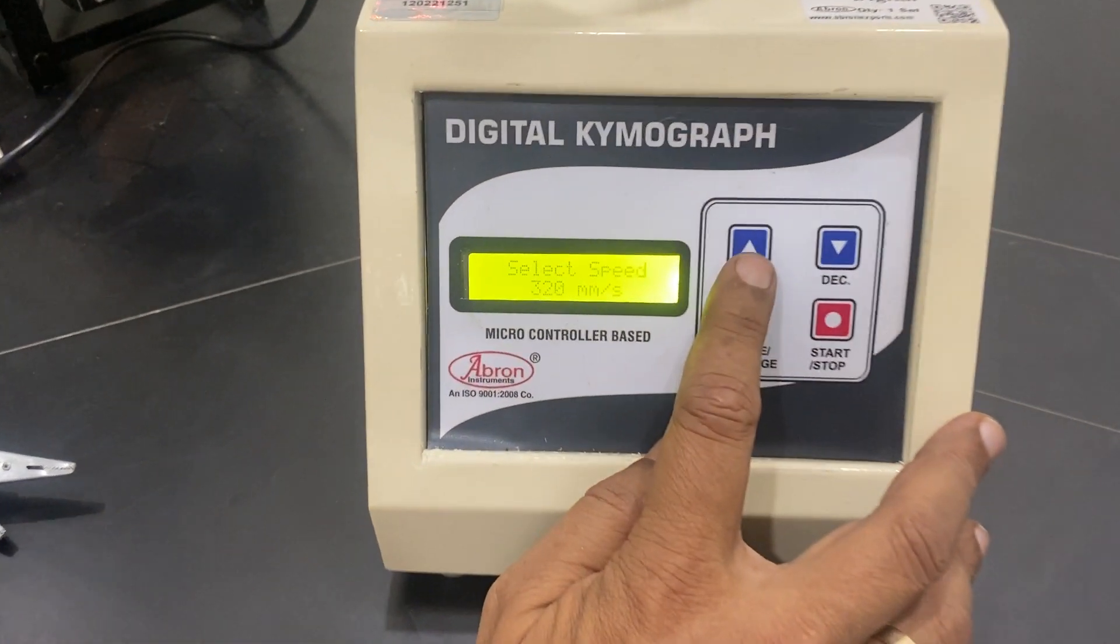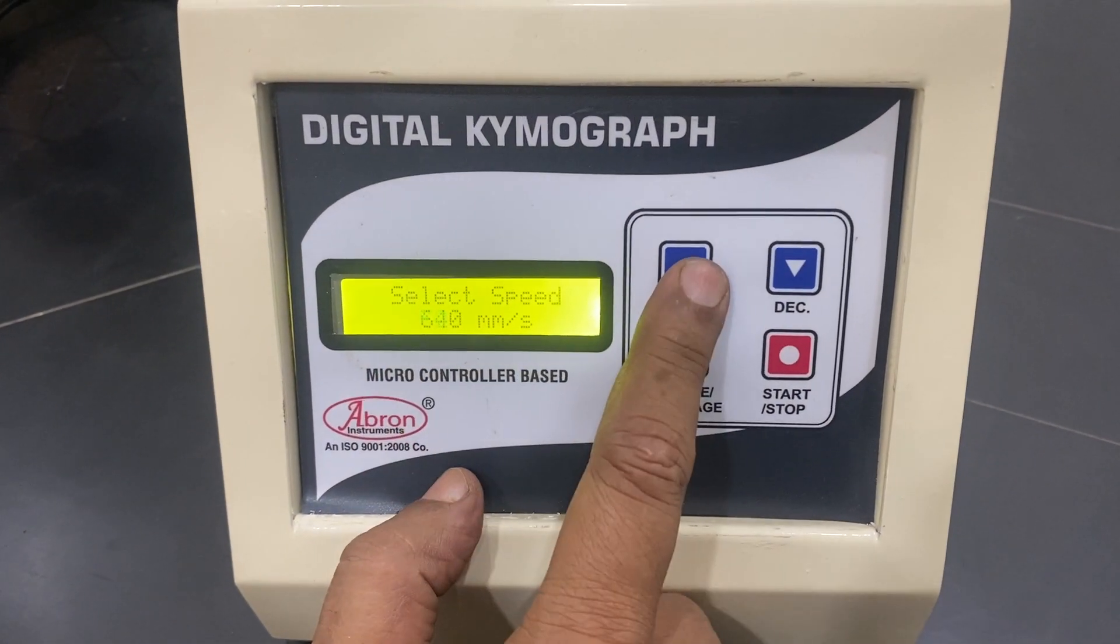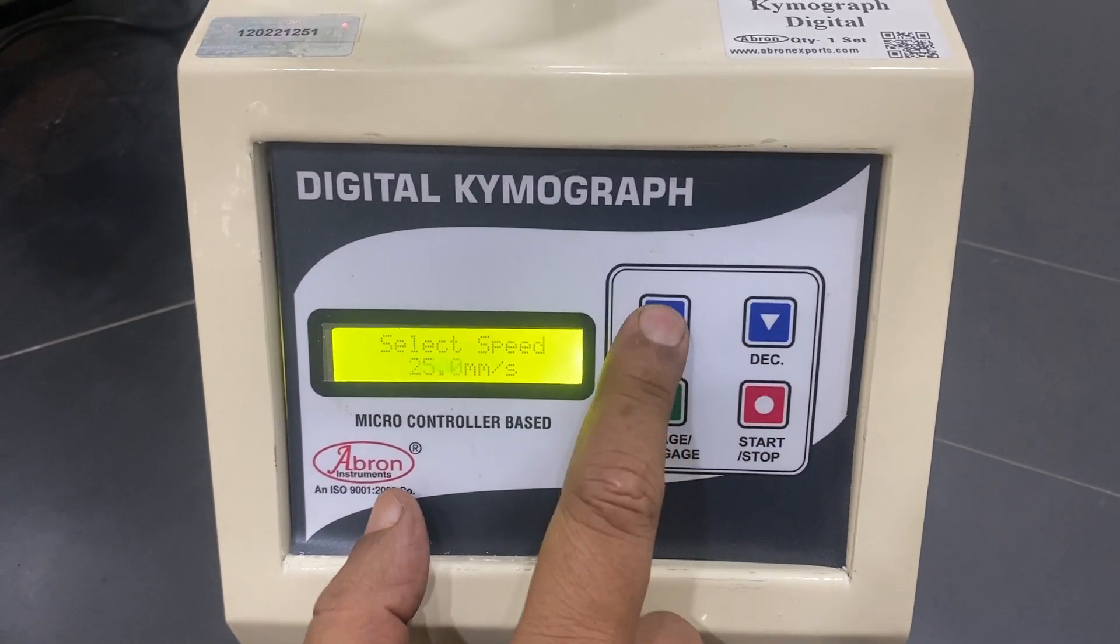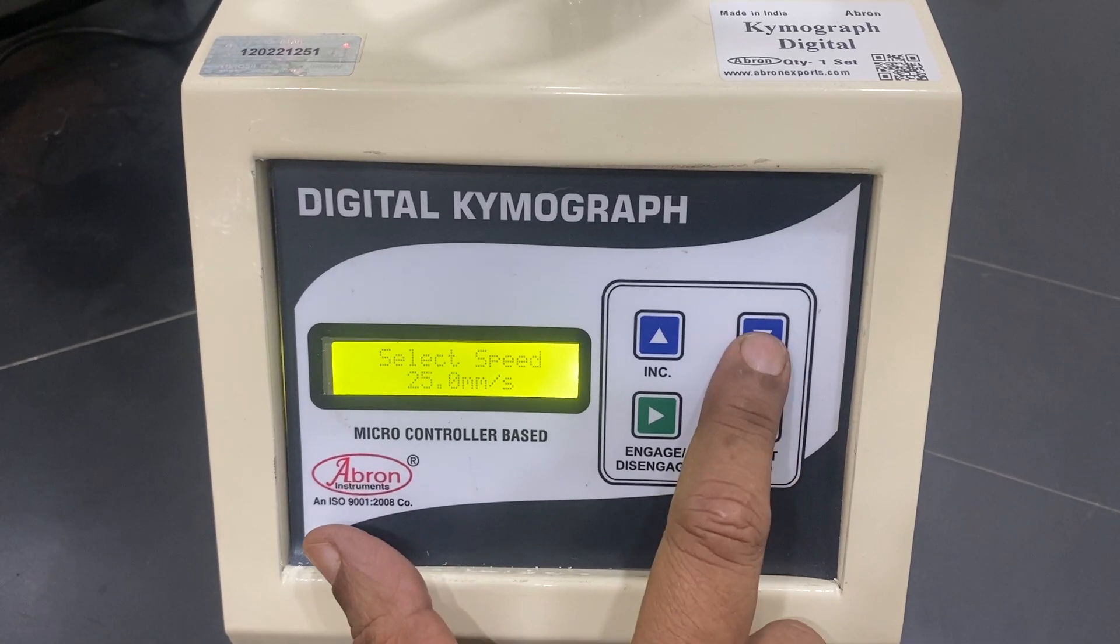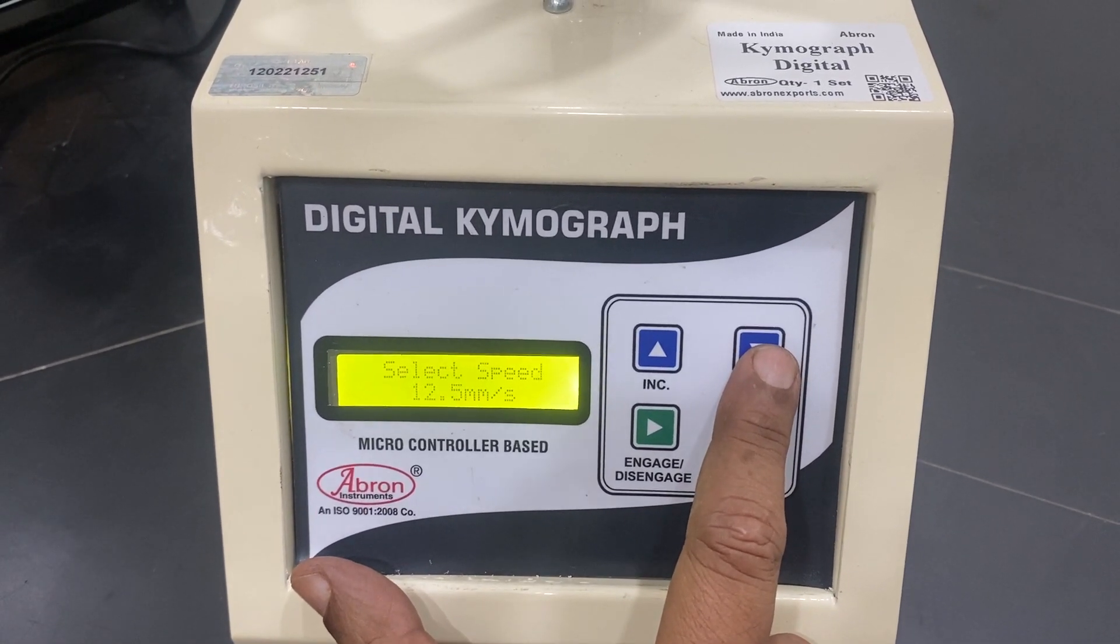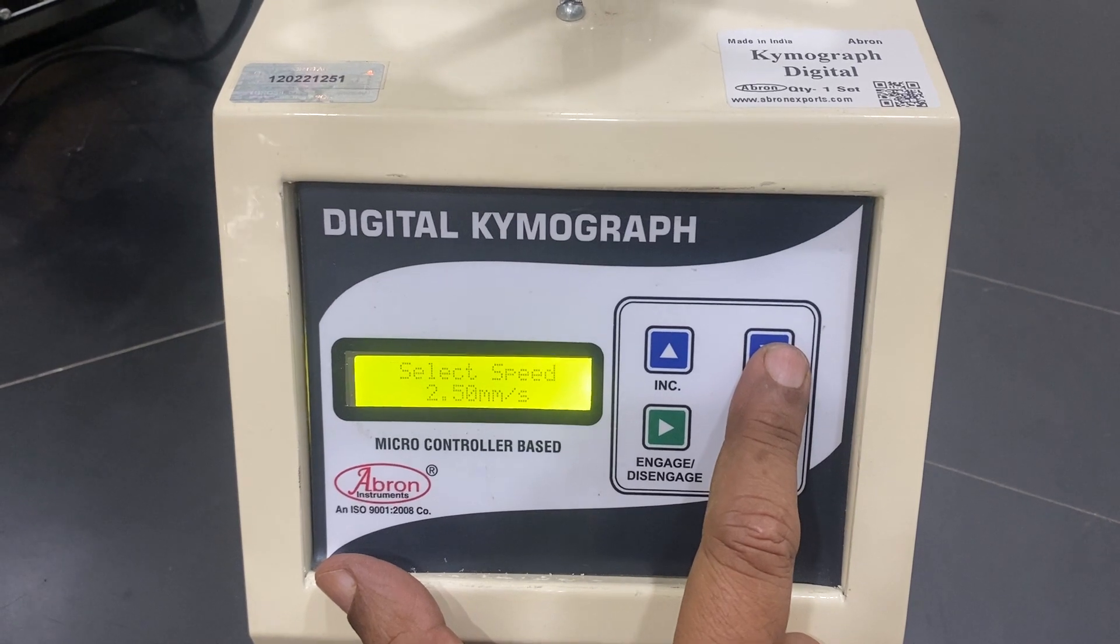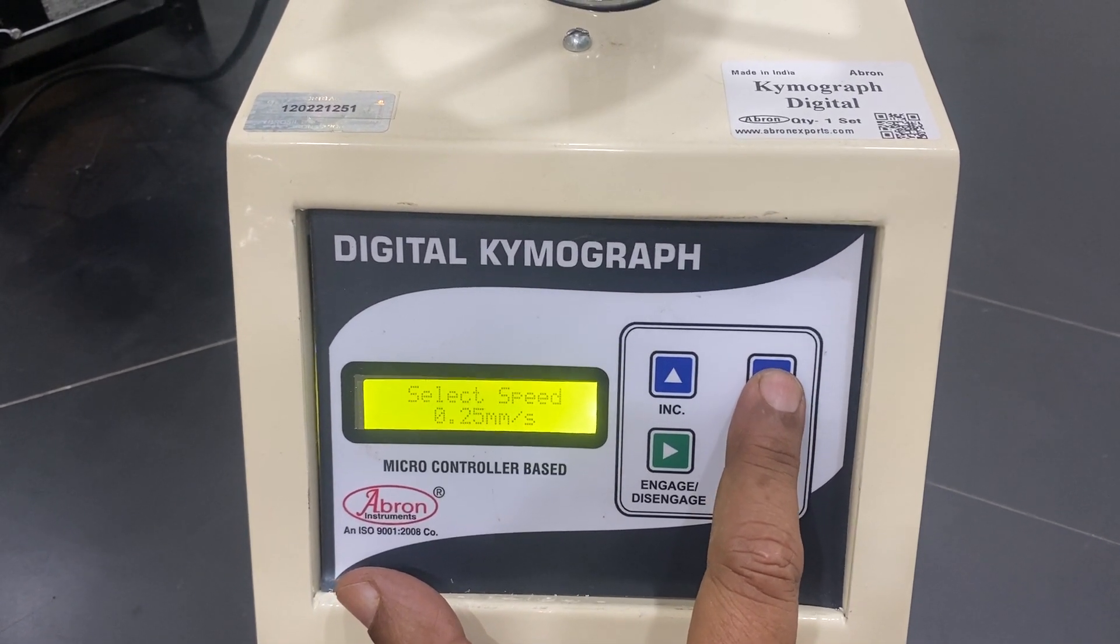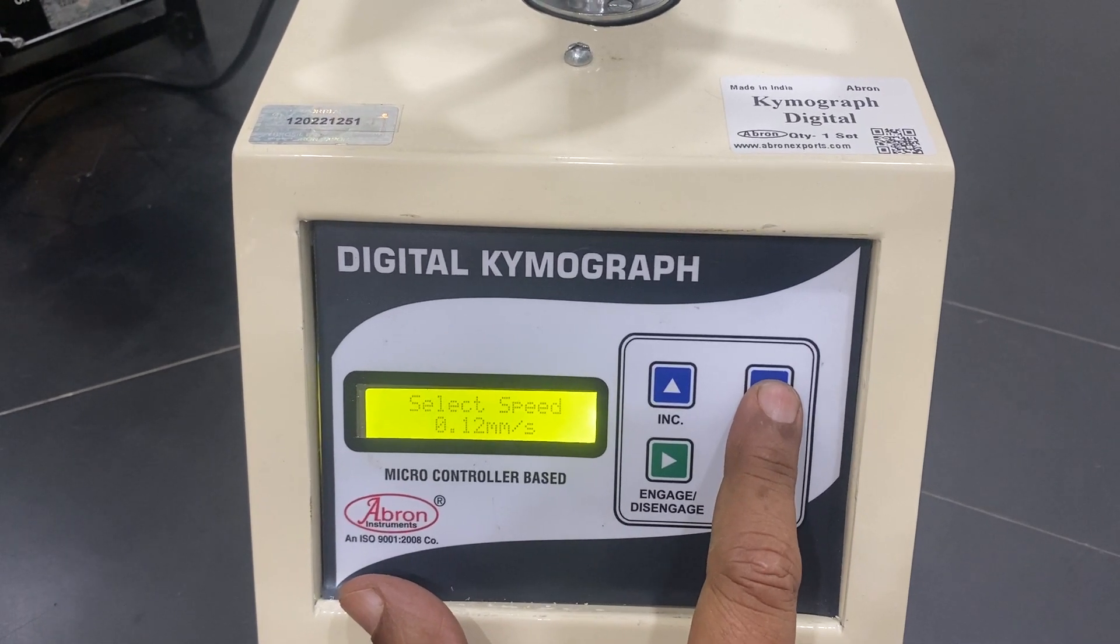Now this has different parts. One is for increasing the speed: 640 mm per second. You can reduce it to 320, then it becomes 25 mm per second, 12.5 mm, 2.5 mm, 1.25, 0.25, and 0.12. This is the last one. Eight speeds are there.